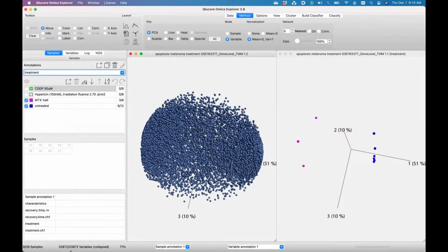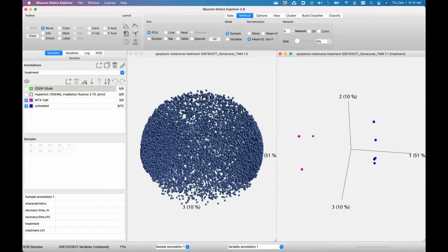You get easy access to counts from the gene expression database. It has been curated and formatted, and GREIN will allow you, with one click, to get the tables for RNA-seq experiments.